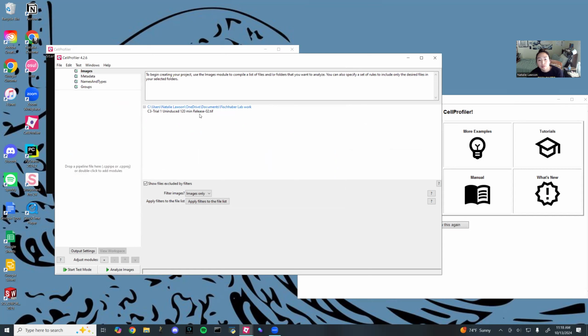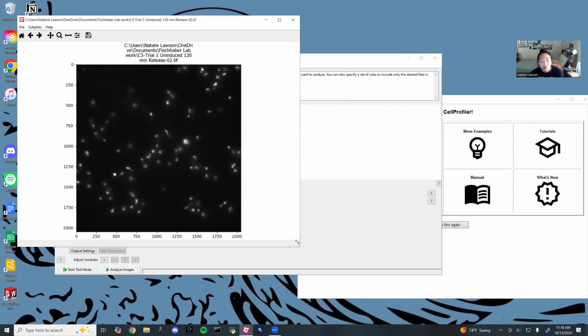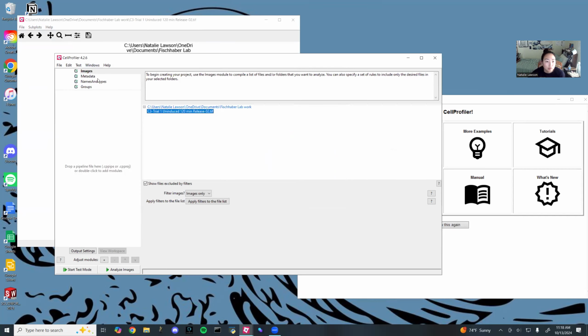So you can see that's the image I just imported. It's just channel 3. If I double click on it, it'll show this image in grayscale, and grayscale is good for analysis. And then this is where you're going to add your modules.